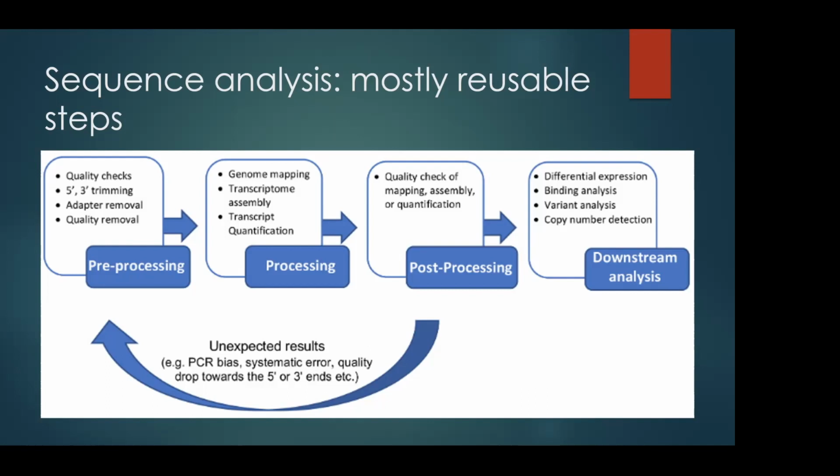But the reason that you are doing this is if you are curious about some sites that are not in your annotated transcript that you found somewhere else, you can do this kind of transcriptome assembly, then quantify them, and find regions that don't exist in existing assemblies or existing transcriptomes. Then you can see maybe something different is going on in your own reads, in your own experiments. So that's why, but this is kind of rare.